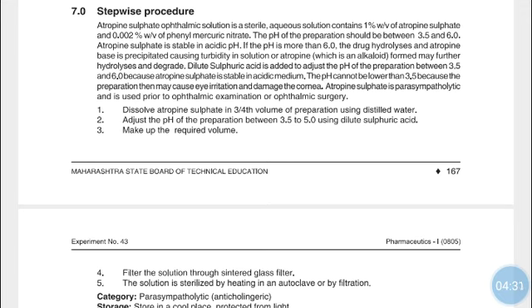The procedure: first, dissolve the Atropine Sulfate in three-quarters of the total volume of the preparation using distilled water.